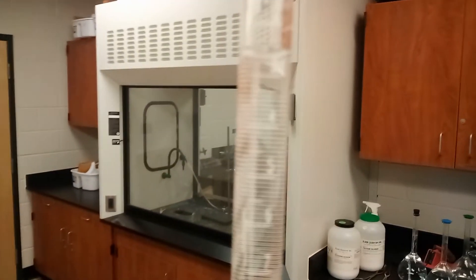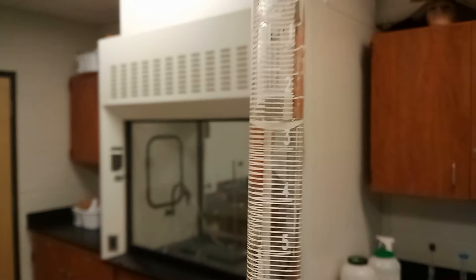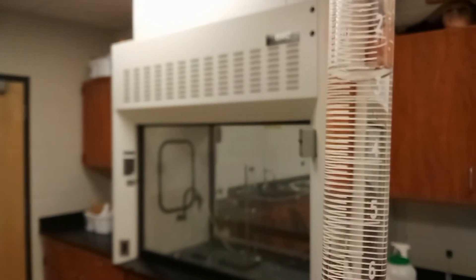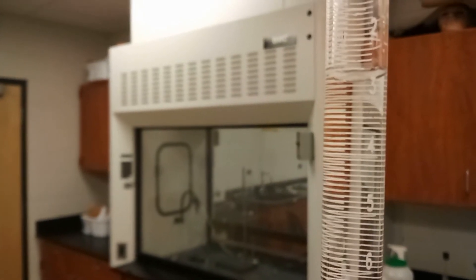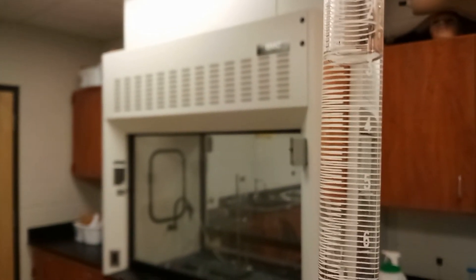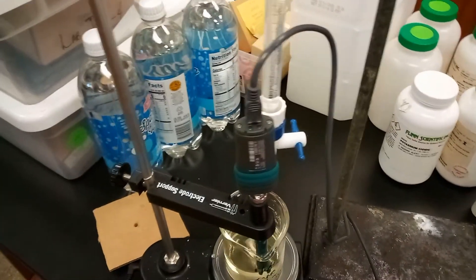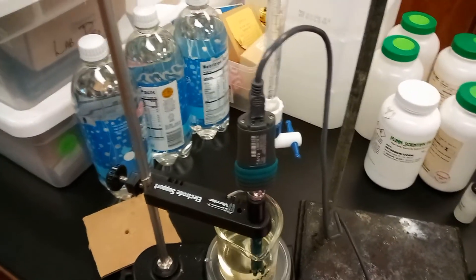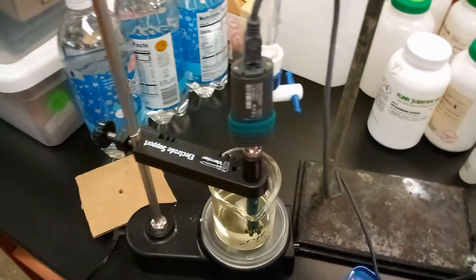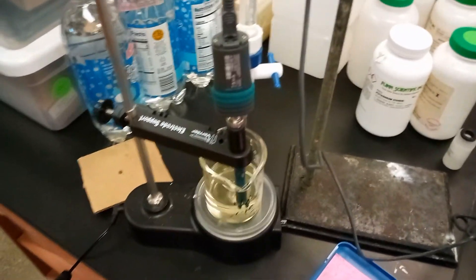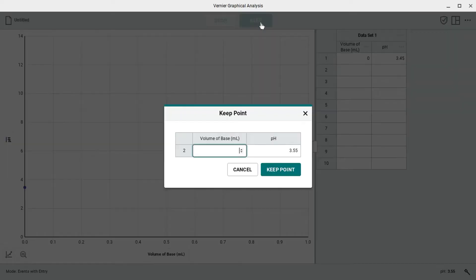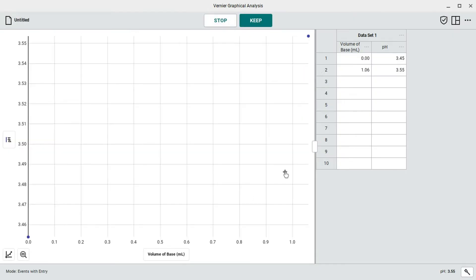That's the first bit added. As you can see here, we are currently at 2.68 or so milliliters. So we'll do 2.68 minus the original 1.62 to get the total milliliters of the base we've added so far as 1.06. On the computer here, we'll go ahead and keep this point. 1.06 milliliters of base added with a pH level of 3.55. Keep the point. Move on to the next one.